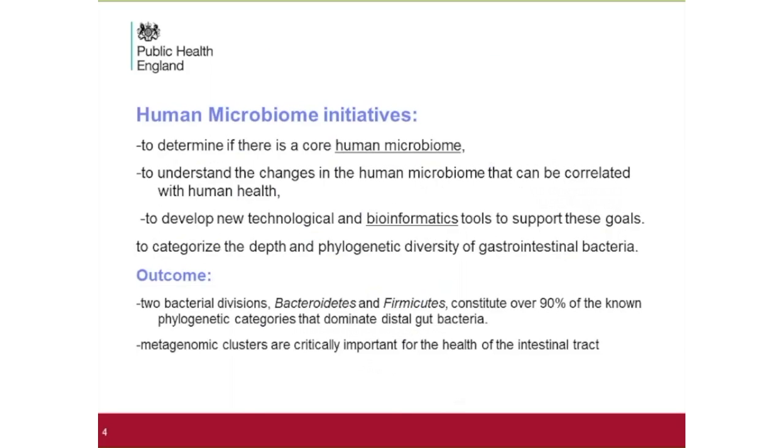There have been several human microbiome initiatives, and the recent set of initiatives over the last 10 years have been driven largely by recent advances in sequencing, the ability to produce highly computerized analytical systems, and bioinformatic tools to decipher variations and similarity between proteins, gene sequences, and between taxonomical groups. As a result, there has been an explosion of work in this area.